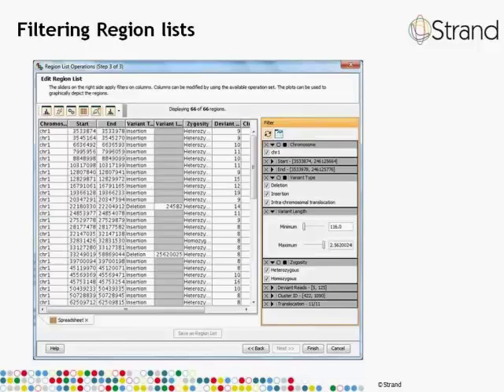After you have compared the SNP and the SV lists and identified the lists of relevance to cancer biology, you can further filter these lists and delve into the biology. Let us say you have some prior evidence that there could be large deletions on a few chromosomes, typical in this tumor. Let us say chromosome 1, for instance.